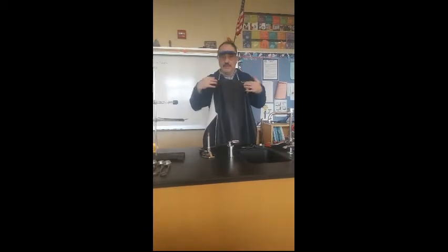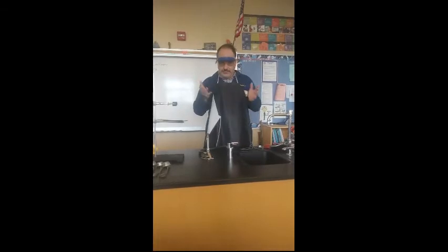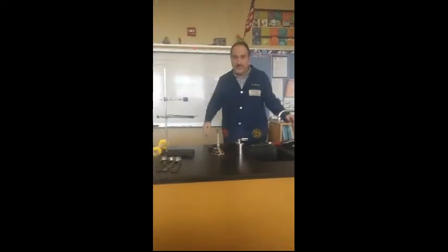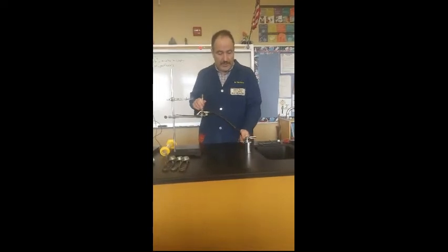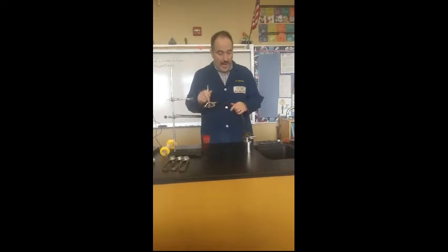You must have these on over your eyes at all times in the lab area whenever you have fire or any type of dangerous chemical. Okay? Now, so you got to be properly attired. That's one step. Another step is you want to make sure that the hose is properly attached onto the nozzle. And they should already be attached, but just give it a little gentle tug and make sure.